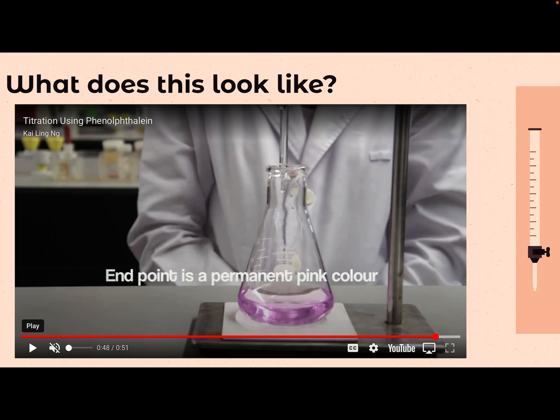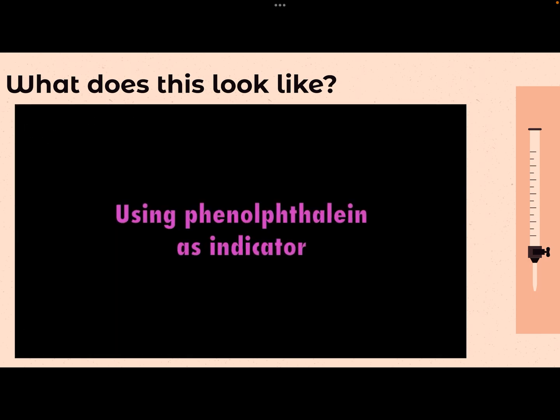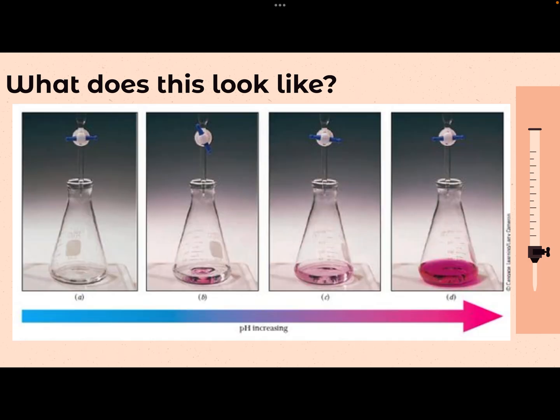It's signaling that you have neutralized all of the acid, and the only thing that's left in there is your water and your salt, but your salt isn't contributing to the color. Your salt doesn't matter for this process, just the water. Okay, so that is what it looks like in video form.